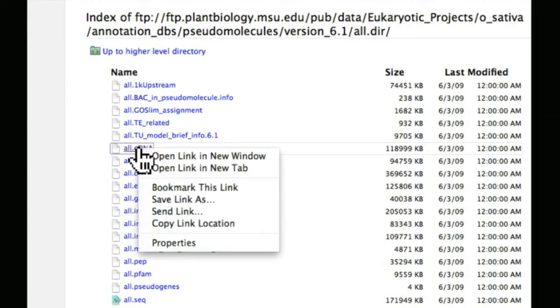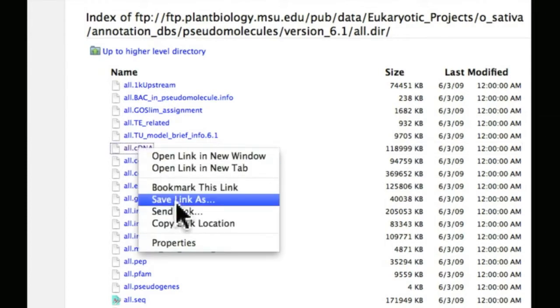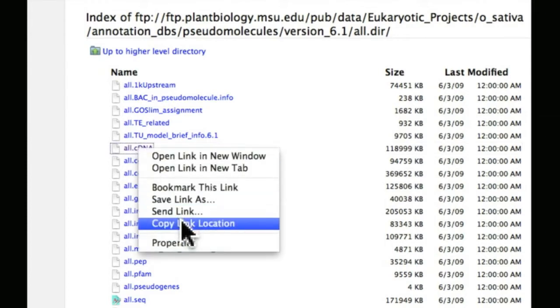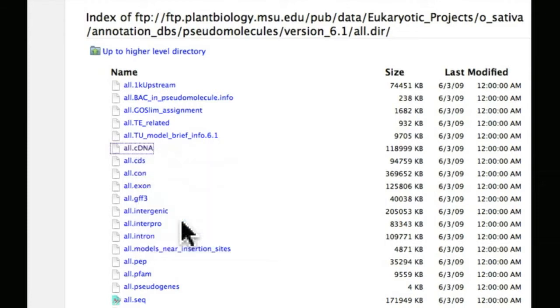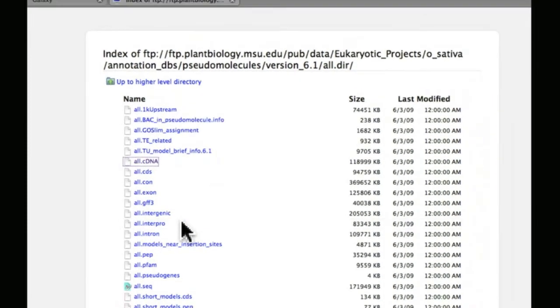Instead, we're going to right-click and say Copy Link Location. Because this time, we're not going to save the file to our computer. We're going to transfer it directly to Galaxy.